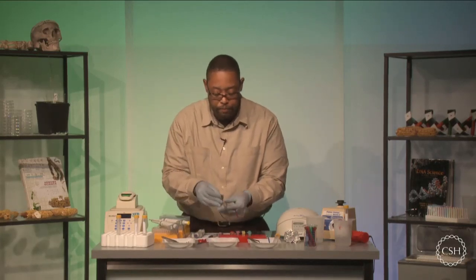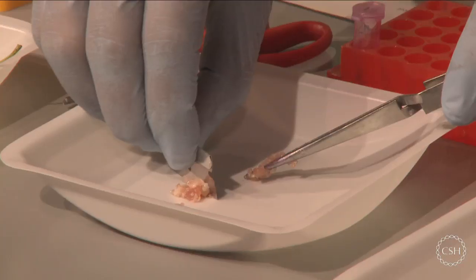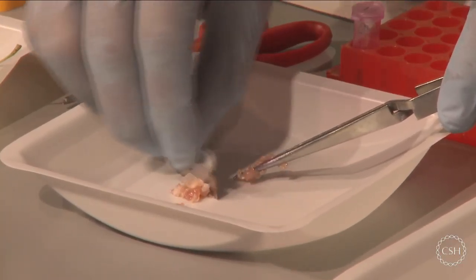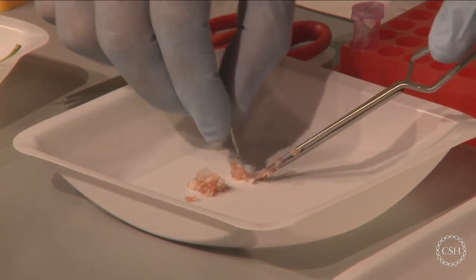So I'm going to take my little razor blade here, and I'm just going to cut off a small amount of material that I want to play with here.